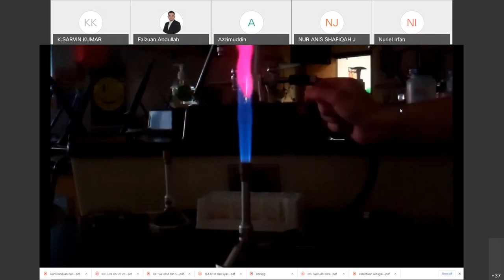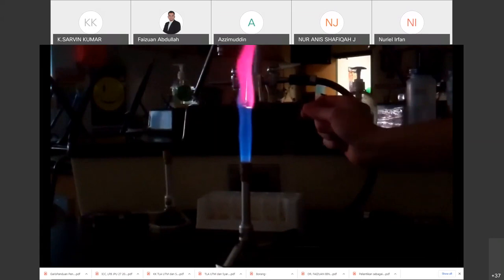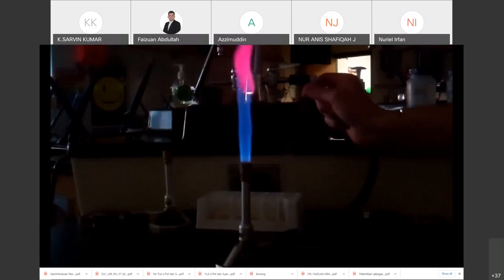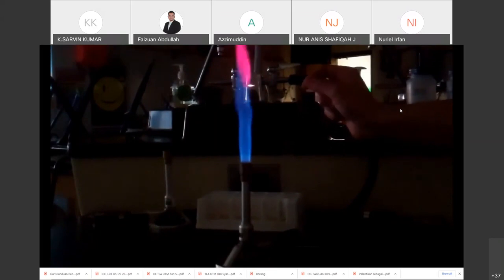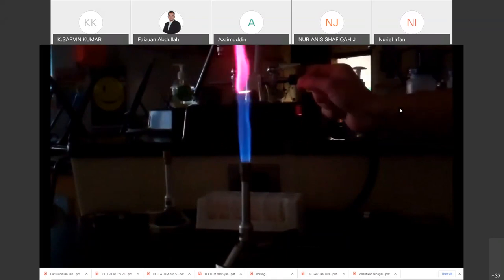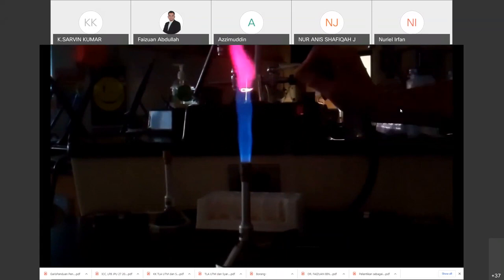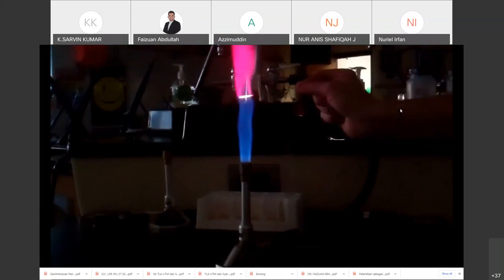This video is lithium. What color? This is lithium. Remember that you want to be descriptive with your colors. Calling this red may not be a good description. You may want to say something about the pink tones that are in there. There may be another substance that we test later that also will appear to be a red color. So we want to just be extra descriptive with our colors.